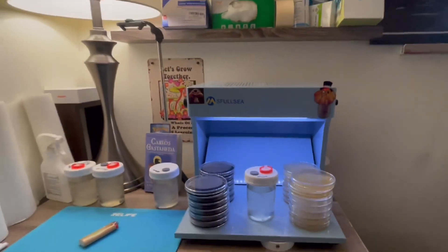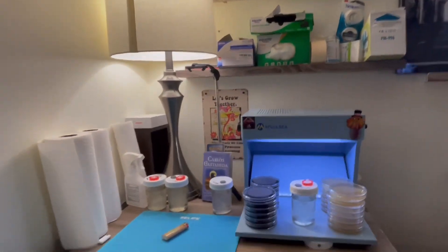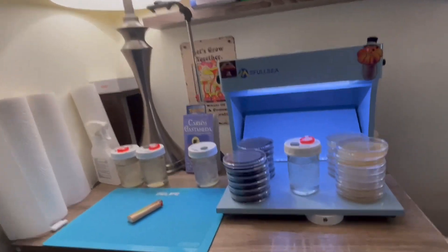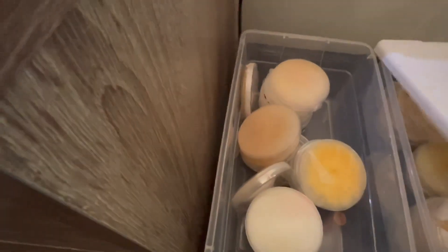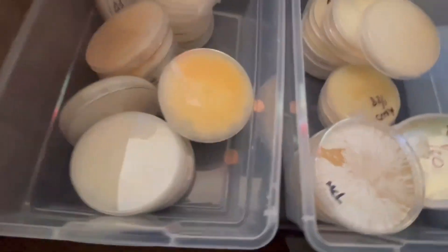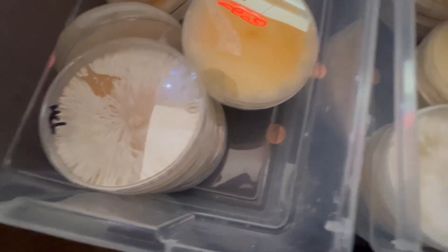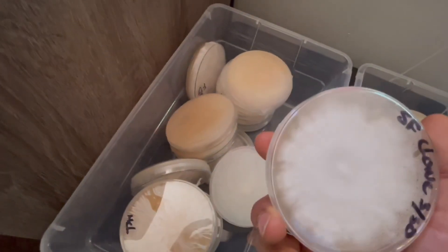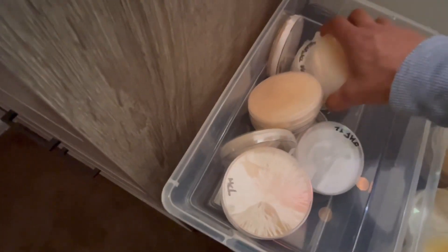I'm working cornered in my room on top of a drawer — not the most professional environment — but I've honestly never had any issues at all. I've got some plates right here and they're all really clean plates. There's a bunch of stuff I play around with, and you can see it works really, really well.